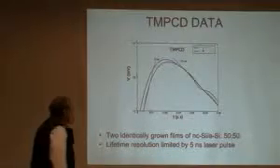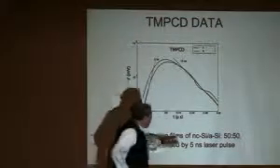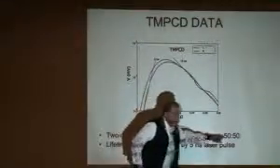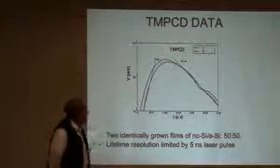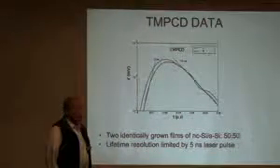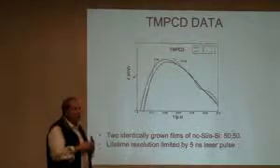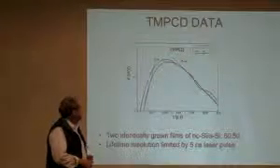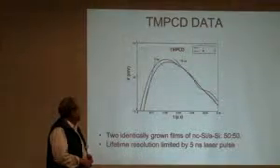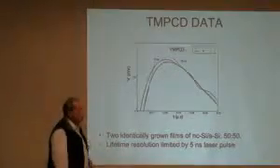One of the breakthroughs that we got with this was one of the early samples, which is not shown here, which was 50-50 nanocrystalline amorphous. We got a good photoconductivity response with the TMPCD apparatus. We had two samples that were made essentially identically, and what we see in TMPCD is this photoconductive decay behavior.